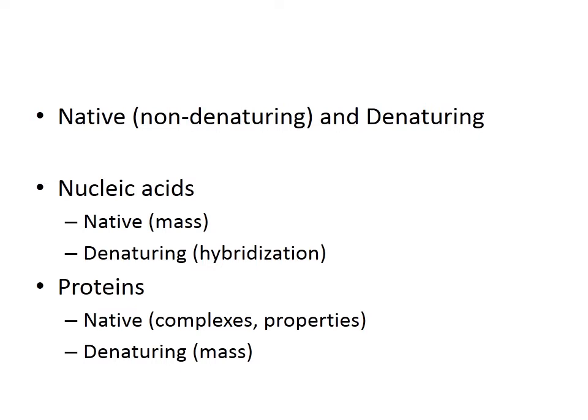Electrophoresis could be done in native as well as denaturing conditions. The native or non-denaturing condition is the one in which the biomolecules remain in their original physiological structure. They are not denatured. The denaturing gels are run when the biomolecules undergo denaturation by using some chemical agent. Native and denaturing gels can be run for both nucleic acids and proteins.